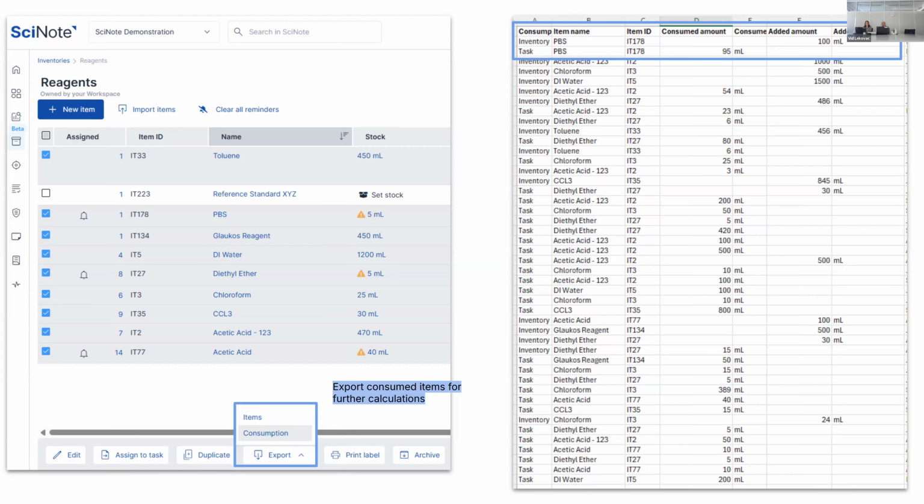They need to understand and have a buy-in, so that you instill that sense of responsibility and ownership over tracking this and why it is important. That they don't see it just as a necessary evil, but they actually do it because they understand that it will help the company. Yeah, it's interesting. All the technology doesn't help if you don't do change management properly. Yeah.